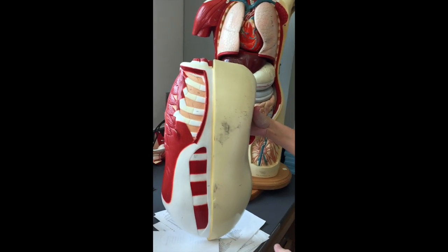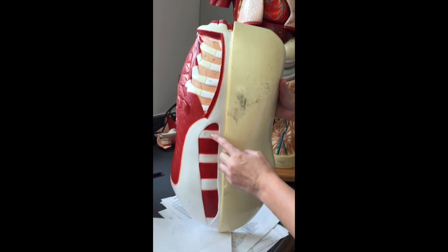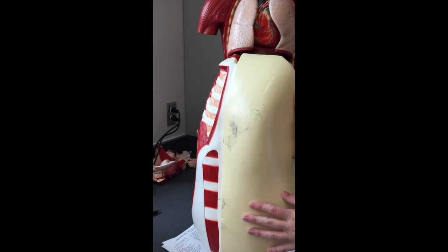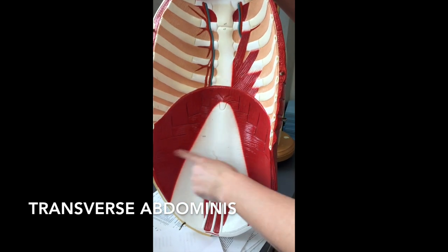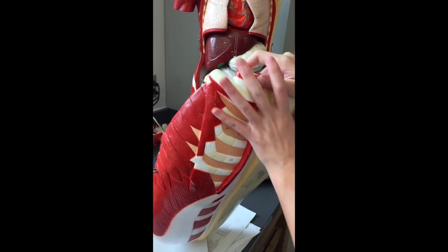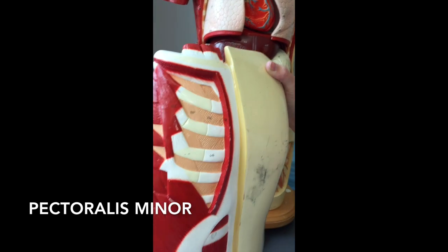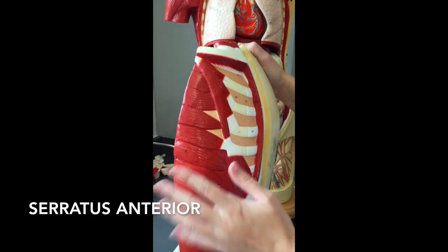We're going to do the abdomen muscles on a different model. Our six-pack abs — these are going to be our rectus abdominus. The external obliques are going to be these ones, because the fibers run down in a downward angle. So external obliques are here, rectus abdominus is here, and you can't see the internal obliques on this model because you have to take the externals off. Underneath though, you can still see the transverse abdominus — these muscles going straight across. Also on this model you can see the pectoralis minor right here. Remember the pectoralis major would be sitting on top. So the pectoralis minor is right here, and you can still see the serratus anterior muscles right here on this model too.